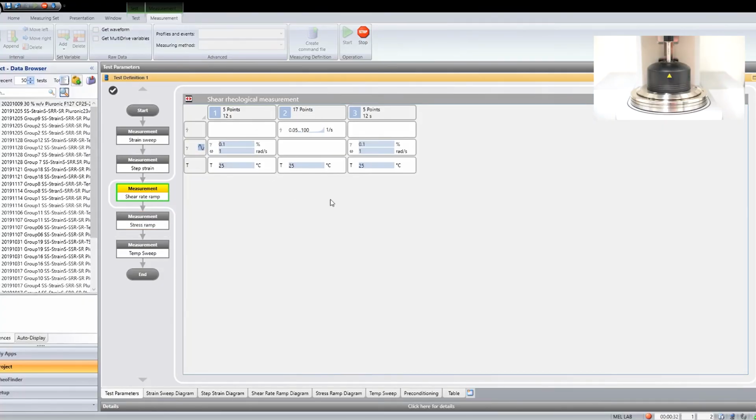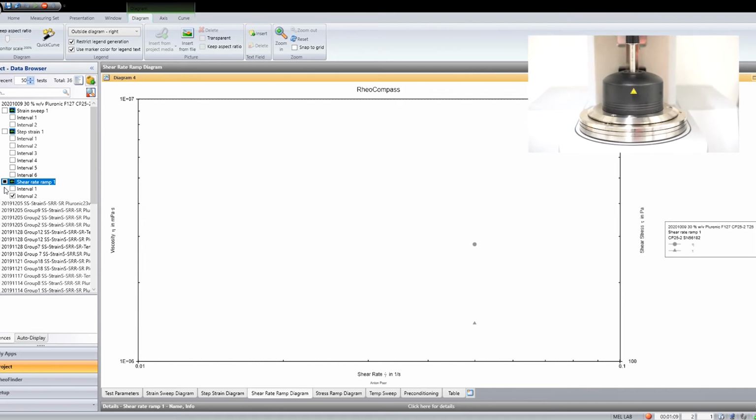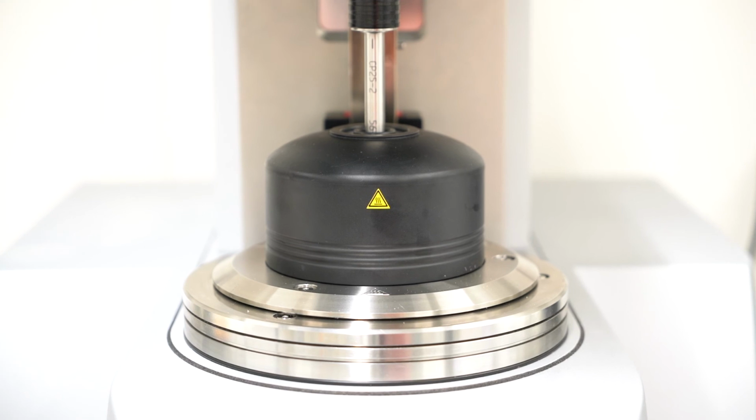To measure such behavior, we can do a shear rate ramp. It is a measurement done in rotation mode, so you will see the geometry moving with increasing rotation rate. What would you expect if we deform this material faster and faster? Would the resistance to flow increase or decrease? Sketch how the viscosity profile may change with this increasing shear rate.